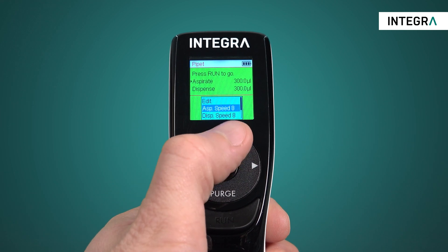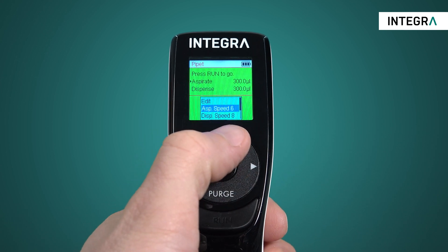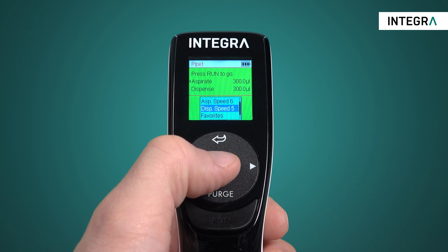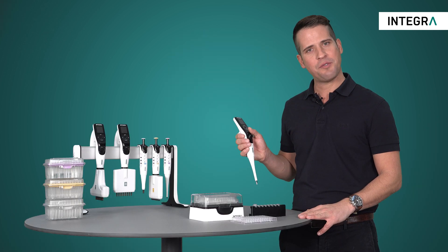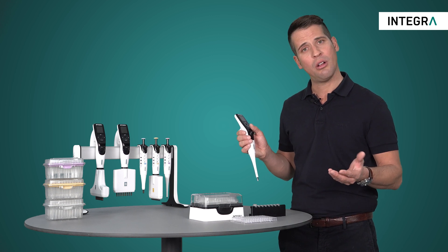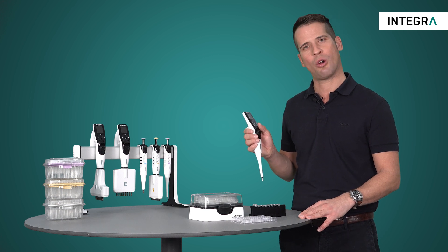The speed of aspiration and dispense can also be changed in this menu. This is always a value between 1 and 10, with 10 being the fastest. In general, the faster speeds are used for more volatile liquids such as alcohol or ethanol, while the slower speeds are used for more viscous liquids or for delicate cell culture work.